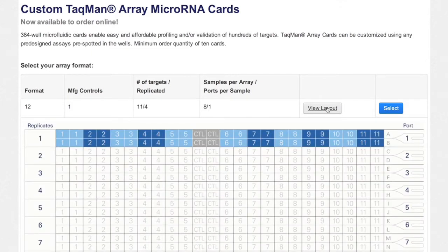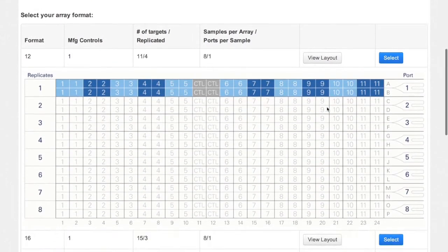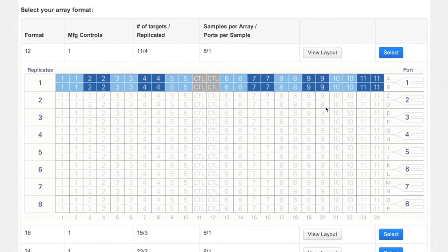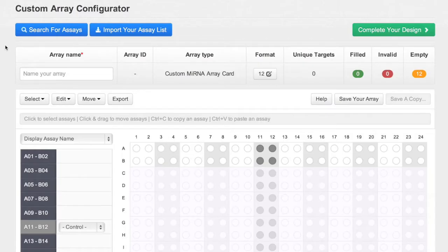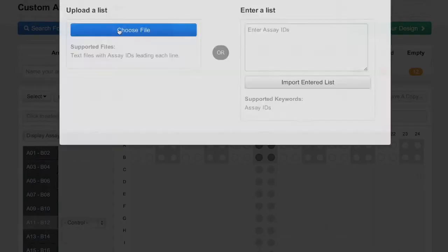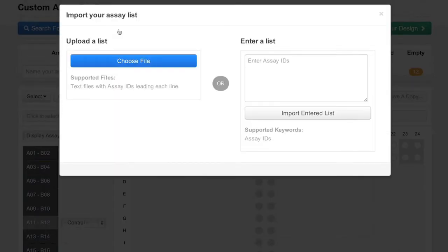In this example, the number of targets of interest is 11, so select Format 12. Search for assays, or, if you already know the microRNA targets of interest, click Import Assay List.